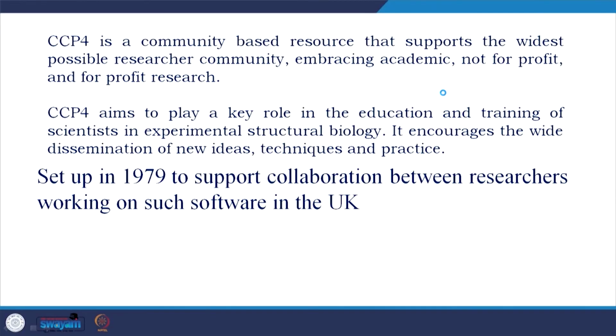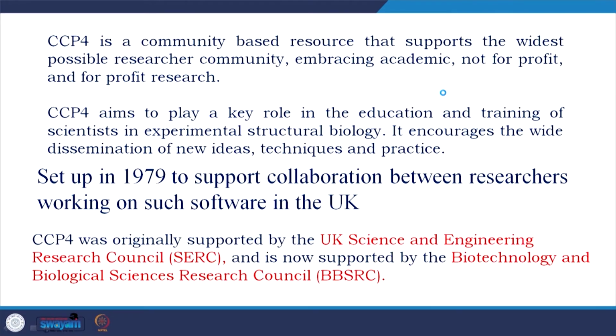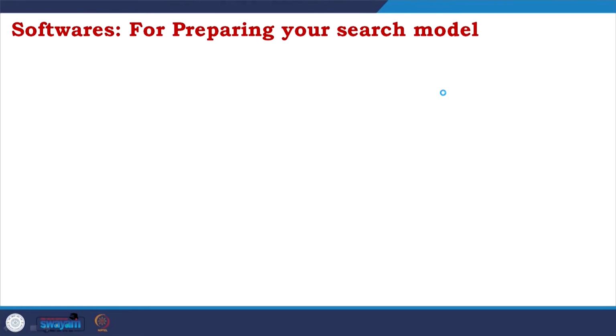Set up in 1979 to support collaboration between researchers working on such software in the United Kingdom, CCP4 was originally supported by the UK Science and Engineering Research Council, which is SERC, and is now supported by the Biotechnology and Biological Sciences Research Council, which is BBSRC.